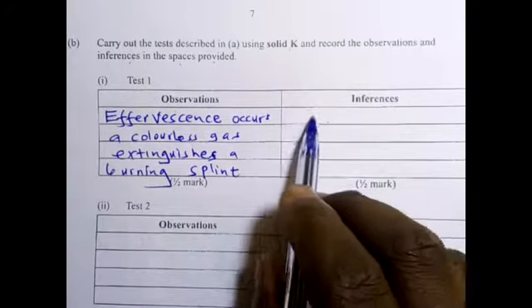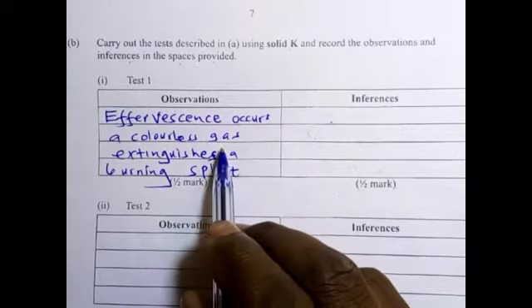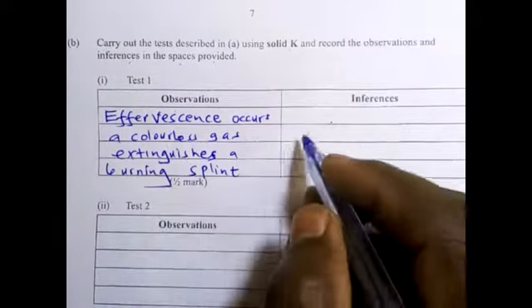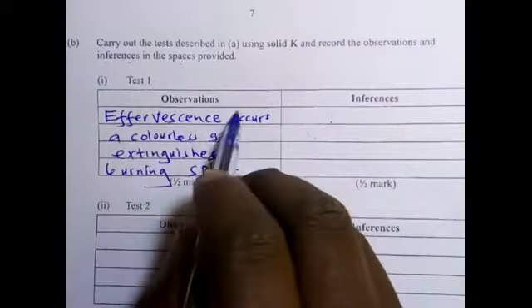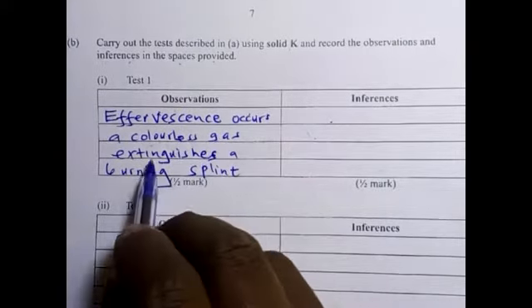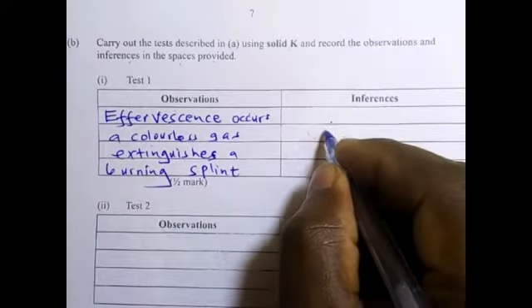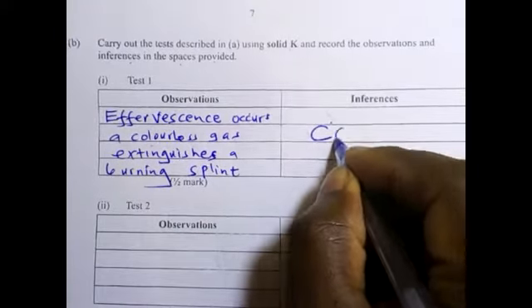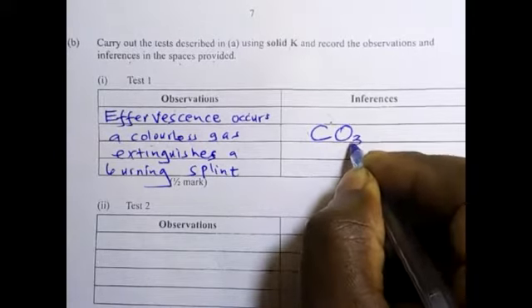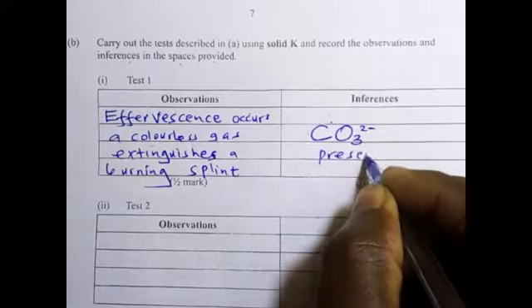So you are supposed now to give the inferences of what you have observed. So definitely, if an effervescence occurs and a colorless gas is produced which extinguishes a burning splint, then that tells you that it is a carbonate, and then you write the CO3 2 minus present.